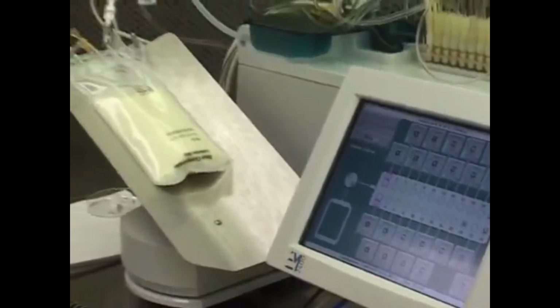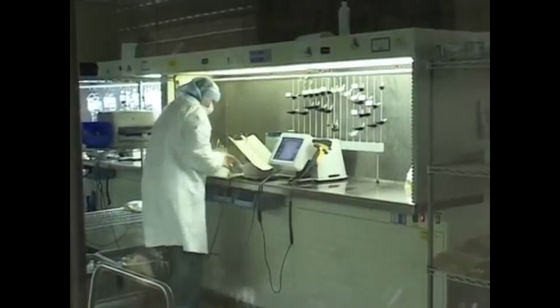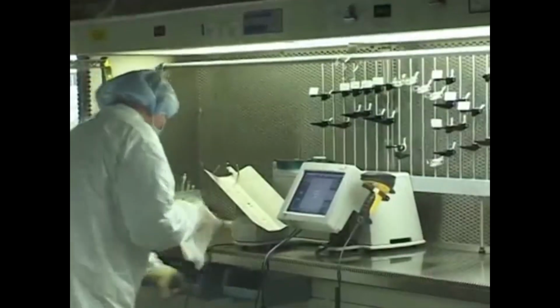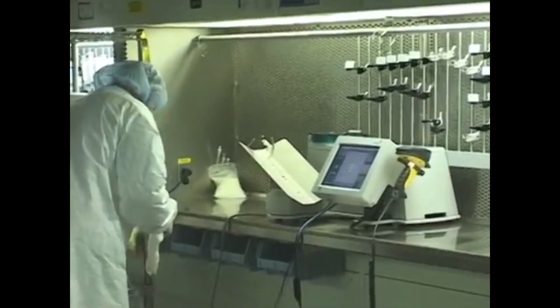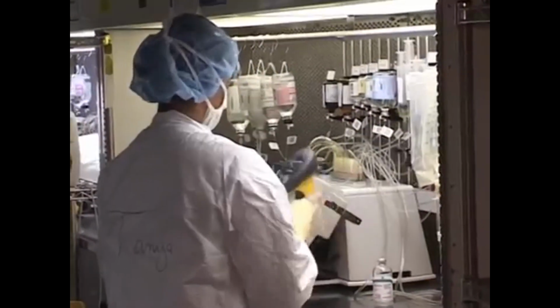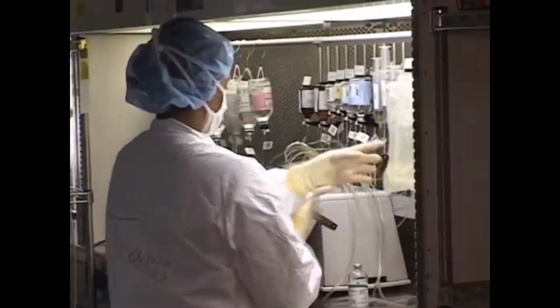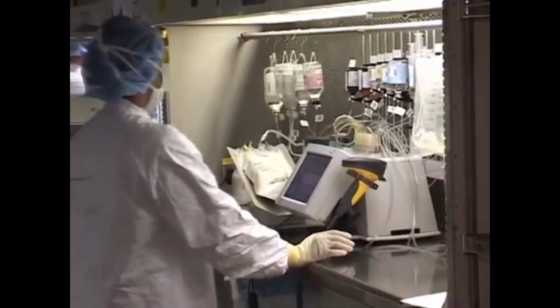ACDs are used inside the laminar airflow workbench and must be cleaned daily according to the manufacturer's instructions. These systems require routine maintenance and calibration to ensure accurate compounding. To minimize the potential for errors, the compounder should be observed during operation. Quality control procedures may be implemented to verify final contents of the preparation.